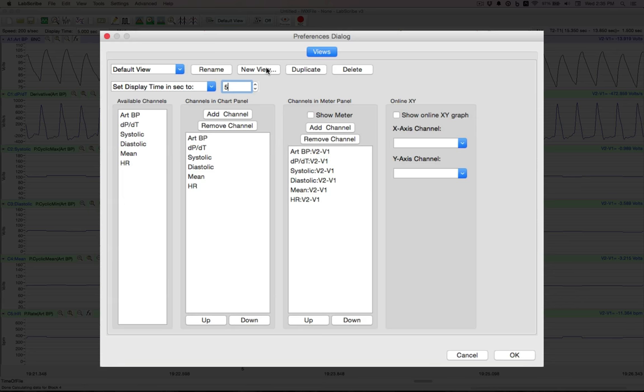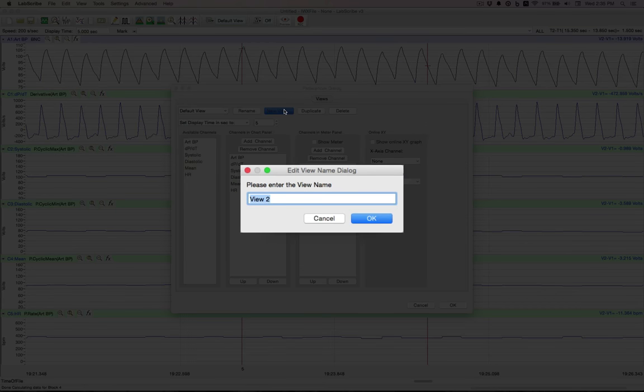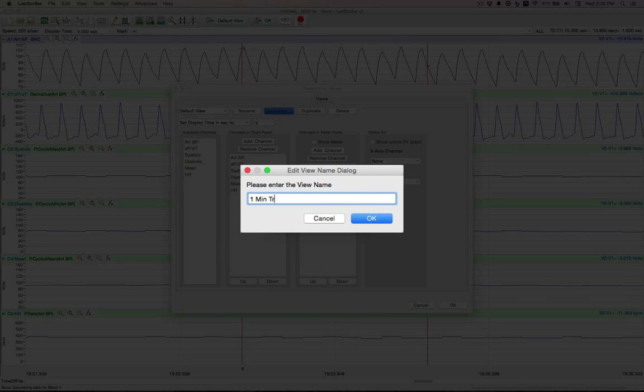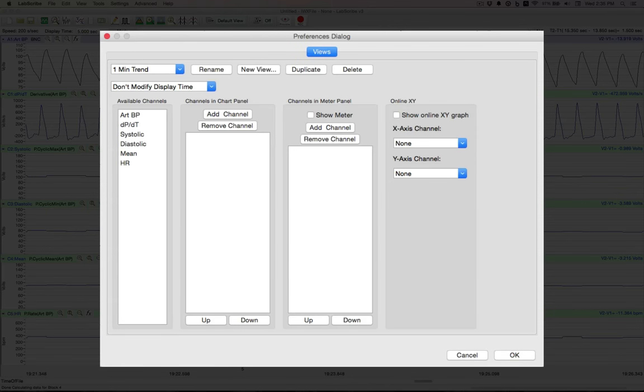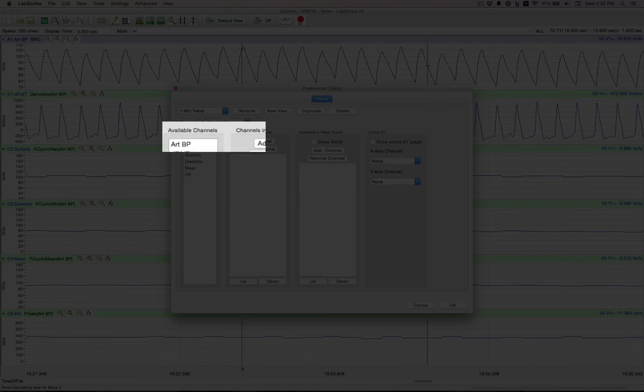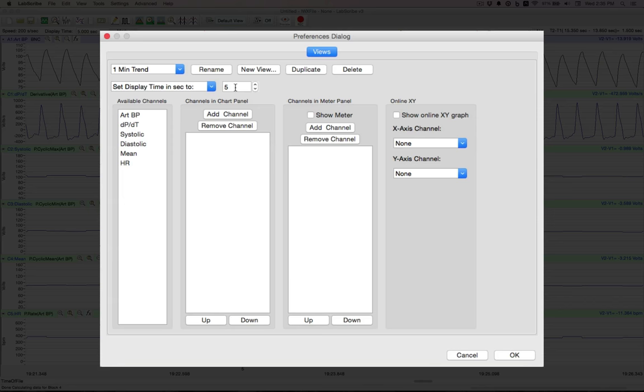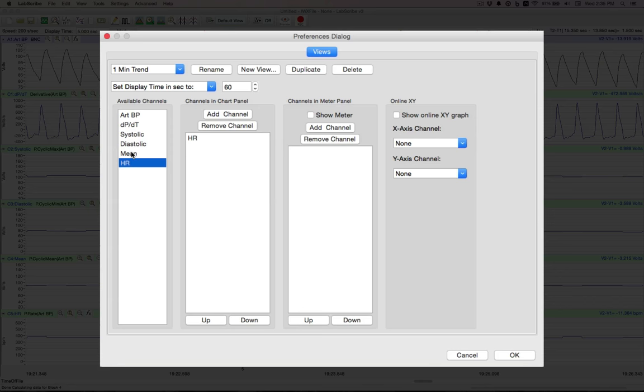With that done, let's make a new view. And we'll use this for our one minute trend. Hit OK. We will change our time to 60 seconds. And the channels that we want in this are the heart rate, we add that, as well as the mean. OK, that one's done.